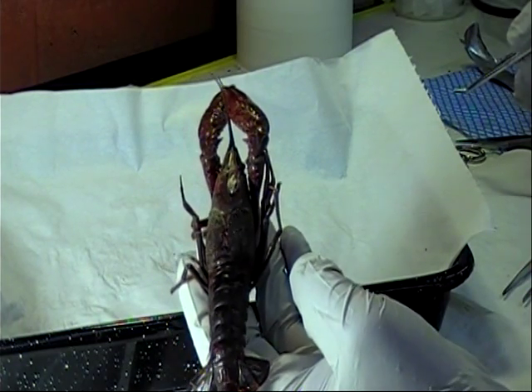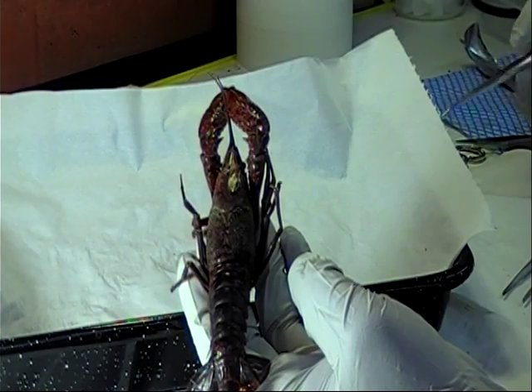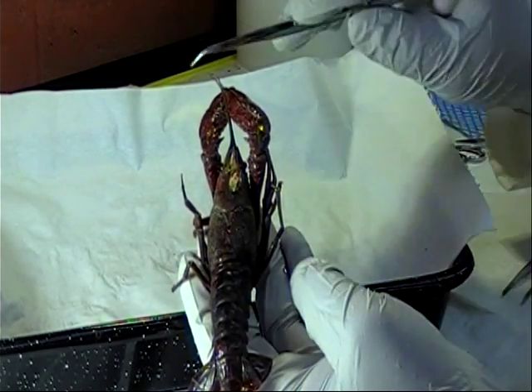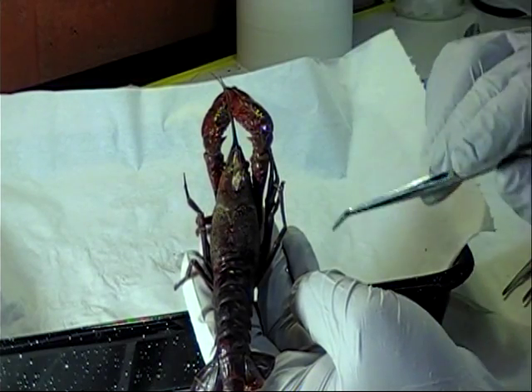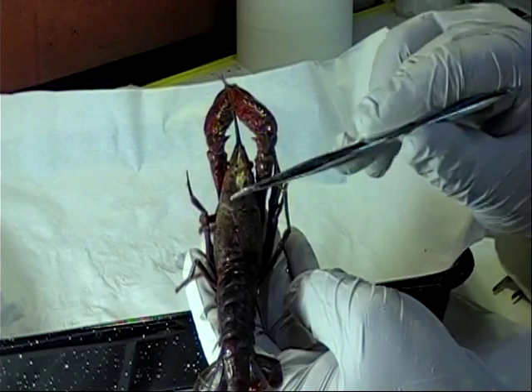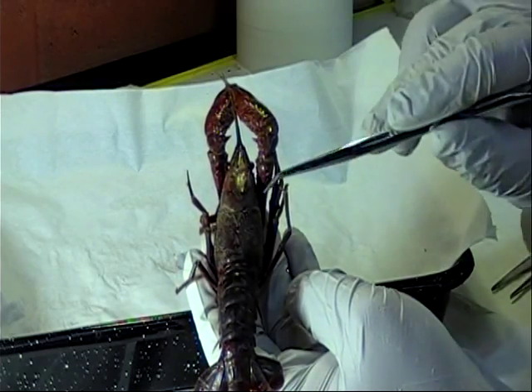To begin our introduction, we're going to look at the external anatomy of the crayfish. Looking at the dorsal, or back of the crayfish, we can see that the body is divided into two main parts: the cephalothorax, which contains the head and the thoracic region, and the abdomen.